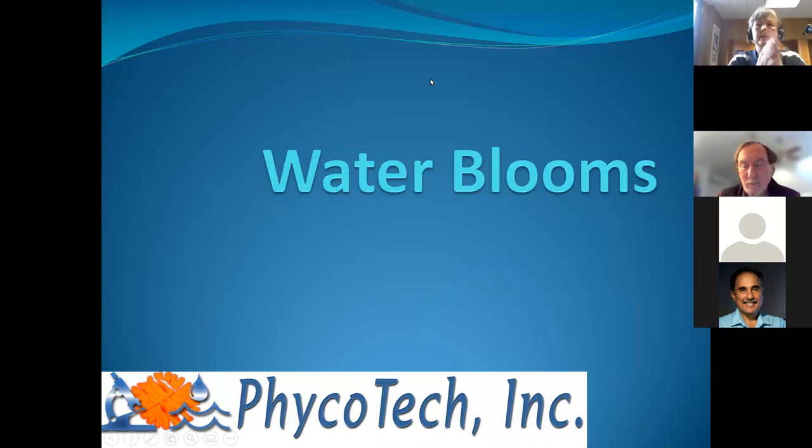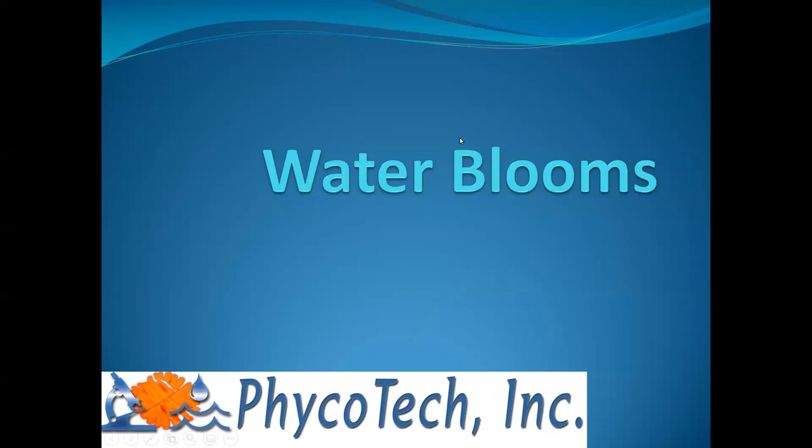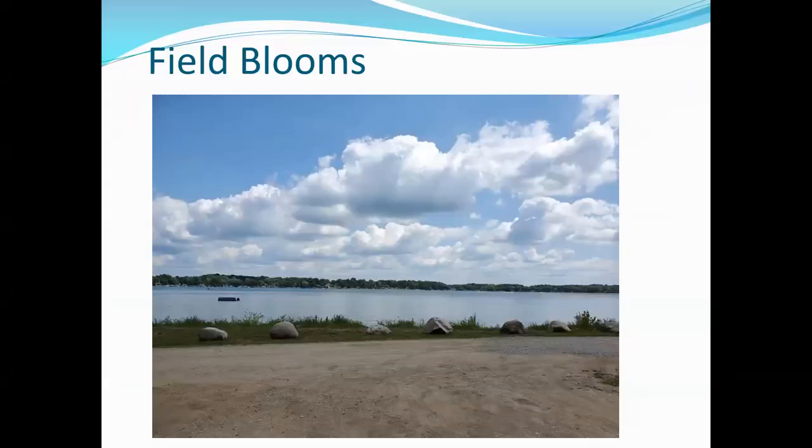Okay, so what this is, it's a compilation of different blooms, both non-blue-green and blue-green, along with microscopic information. So you can kind of get a sense for what these things look like out in the environment. So these are all field blooms, and all of them, we actually were able to confirm the material that was in the bloom.